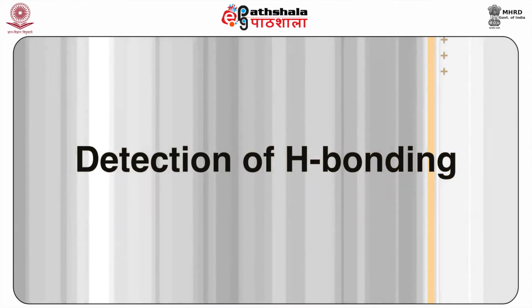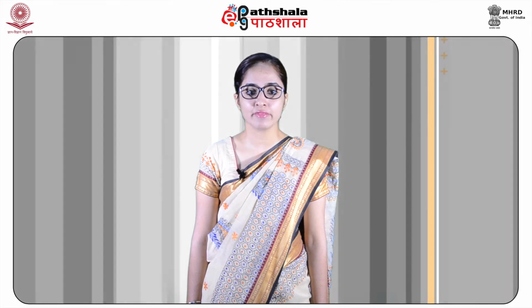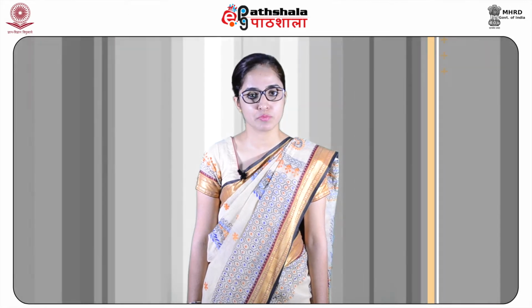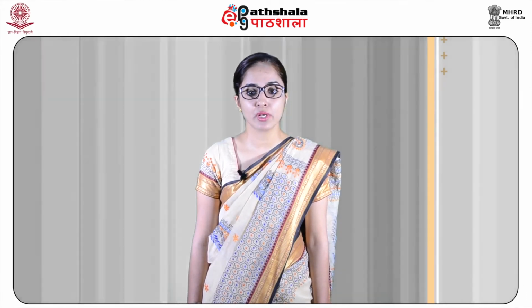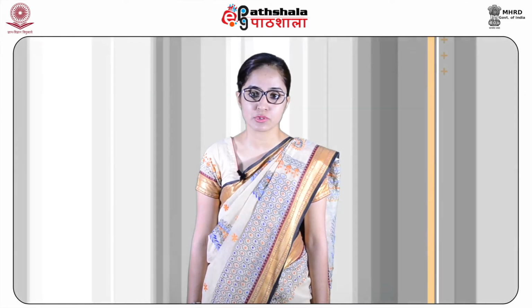Detection of hydrogen bonding through NMR spectroscopy, that is the next application. In general, hydrogen bonded protons show a higher value of chemical shift than the ones which are non-hydrogen bonded. The downfield shift of the absorption depends on the strength of the hydrogen bonding. Greater is the degree of hydrogen bonding of a particular proton, greater is the downfield shift of that particular proton. The intermolecular and intramolecular hydrogen bonding can be distinguished by the use of proton NMR spectroscopy.